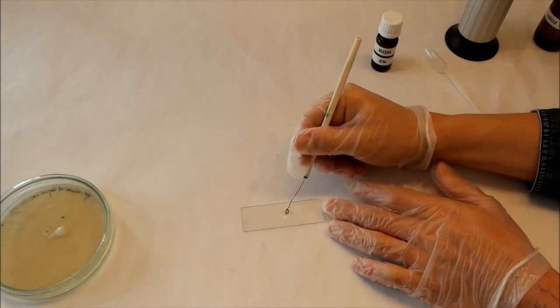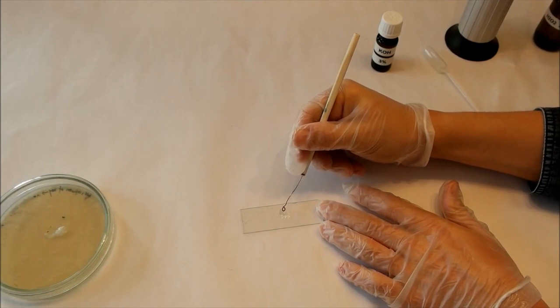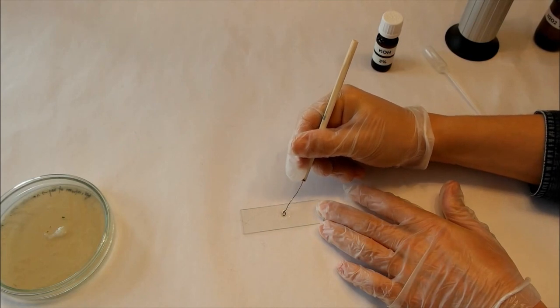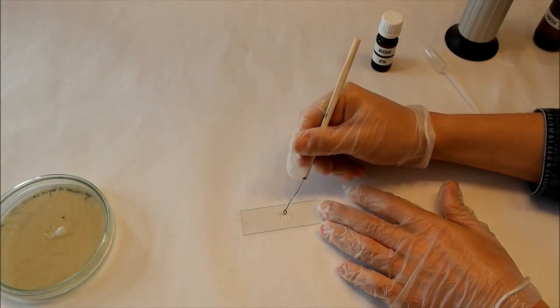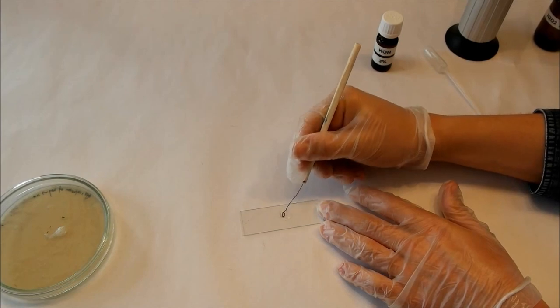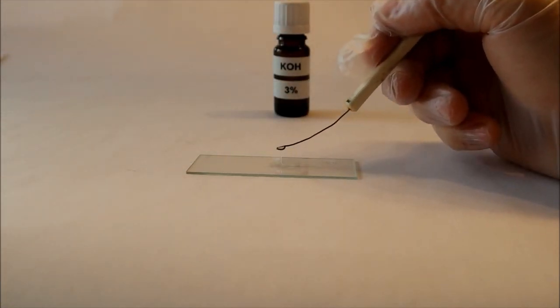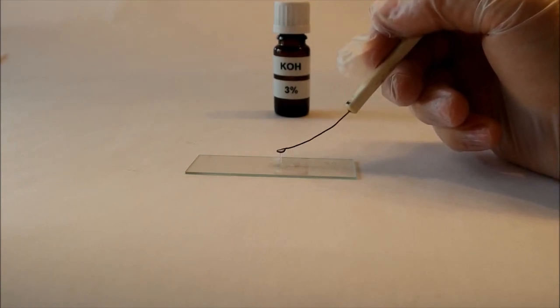And now, if there are thin lines, yeah, so there are really thin lines of DNA. I think you won't see it. Let's zoom in a bit and show you this again. I hope you can see it now. Yeah, this really seems to be gram negative bacteria, because I can clearly see these lines of DNA.